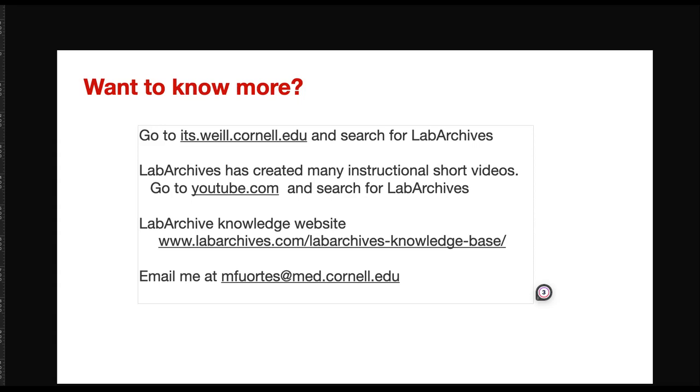Terrific. Michele, thanks for doing this overview today of LabArchives. I learned a great deal, and I'm very happy to see that so many people attended and learned a great deal as well. As far as RedCap goes, and thinking ahead to things like the NIH data management and sharing policy, please continue to use RedCap. As Michele pointed out, do not use Excel.